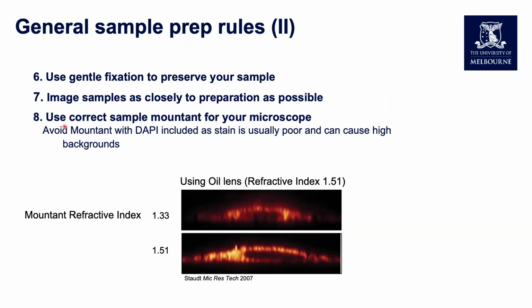Next rules we have are try and fix your sample as gently as possible. So you don't want to overfix and create artifacts within your sample. And you probably want to image your samples as closely to preparation as possible. So it doesn't need to be immediate, but certainly you don't want samples sitting around in the fridge for weeks or months before you come to image those samples.